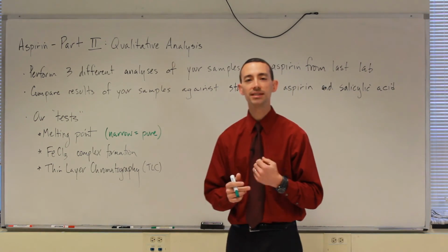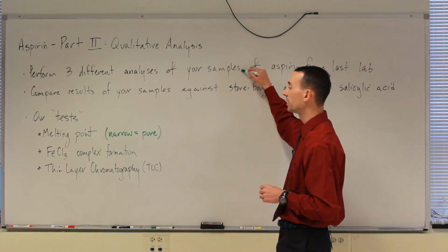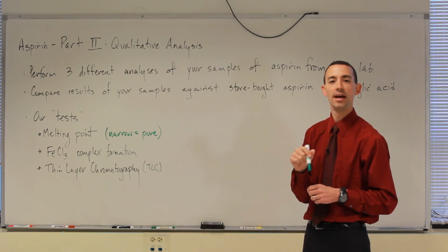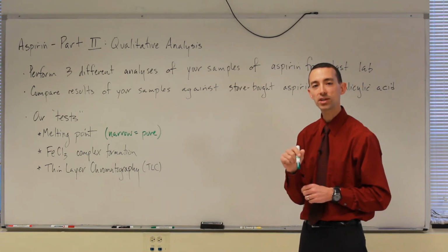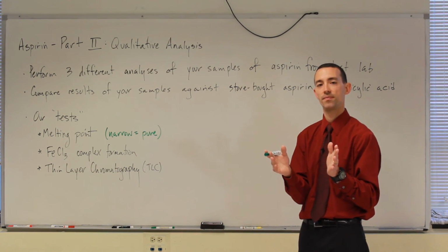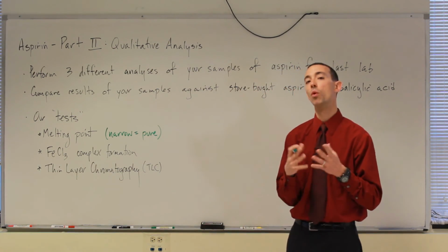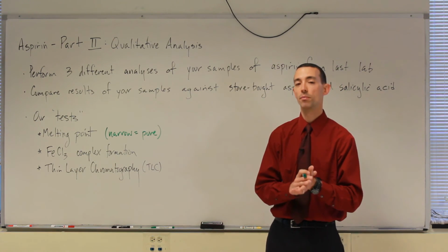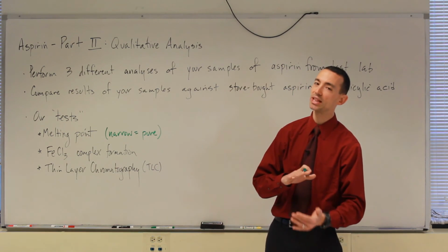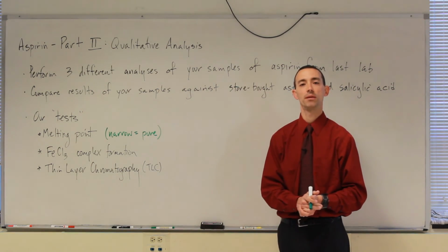Perhaps the most common impurity that we're likely to have in our aspirin samples that we made is leftover salicylic acid that didn't react, and is still there. That would mean you have a mixture in your melting point tube, and so you might expect a larger melting point range. So I would expect that the raw sample, which is more likely to have any contaminants in it, would probably have a larger melting point range, which also, remember, means it should be lower as well. Mixtures have lower, wider melting points than pure compounds.